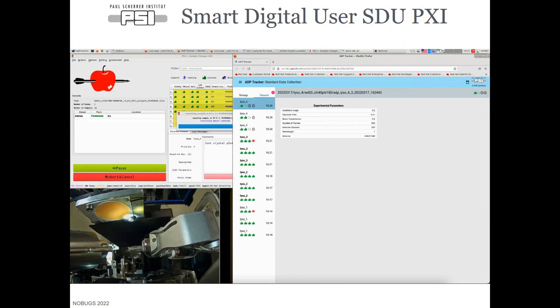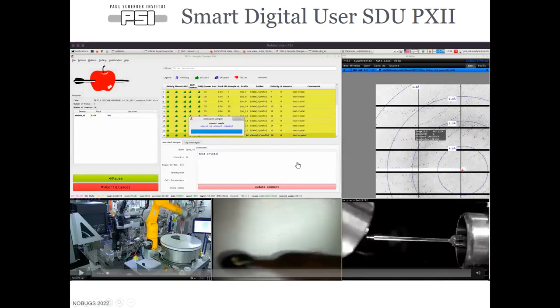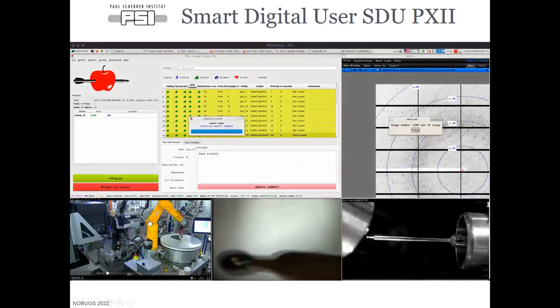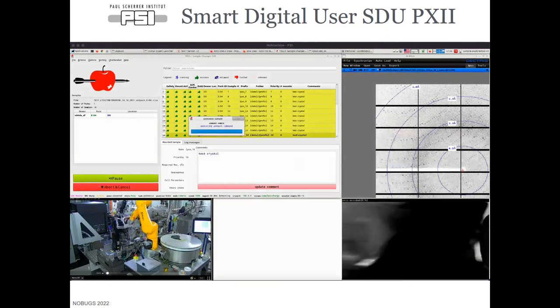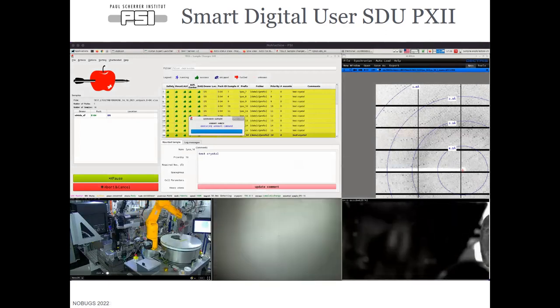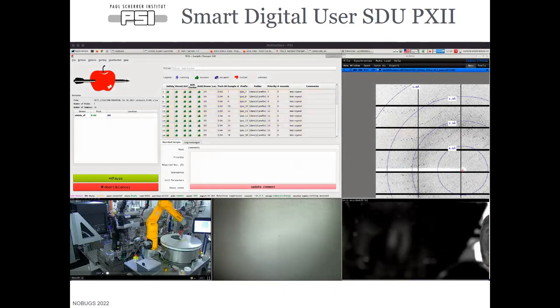All of this gets merged in the background using the HKL from the first dataset as our reference. One of the nice things with SDU is we can run it overnight — we quite routinely set this up and let it collect 300 samples overnight. Once it's finished all the measurements, it will unmount the sample, return the beamline to a safe state, put samples back into the robot drawer, move devices to a safe place, and then automatically generate a PDF report with information on the data acquisition.